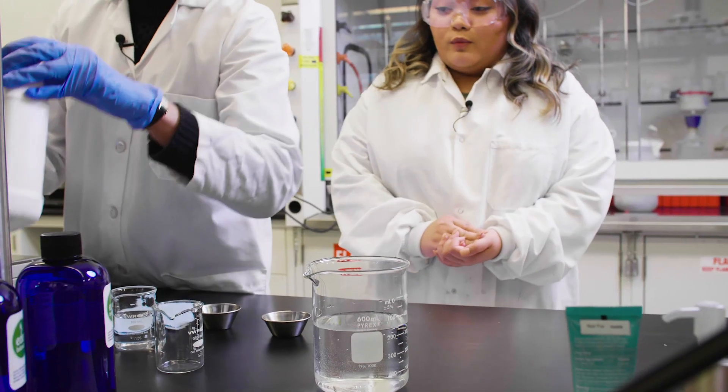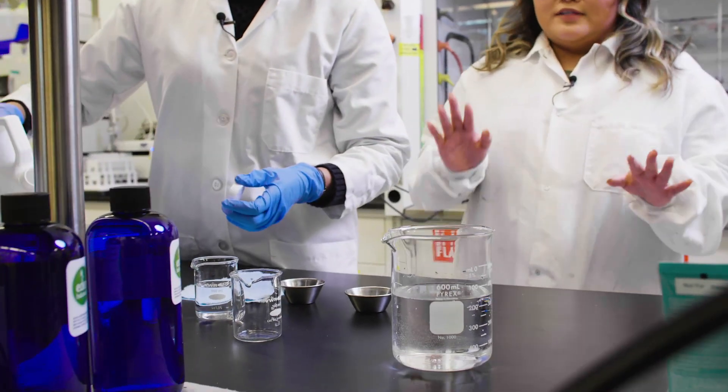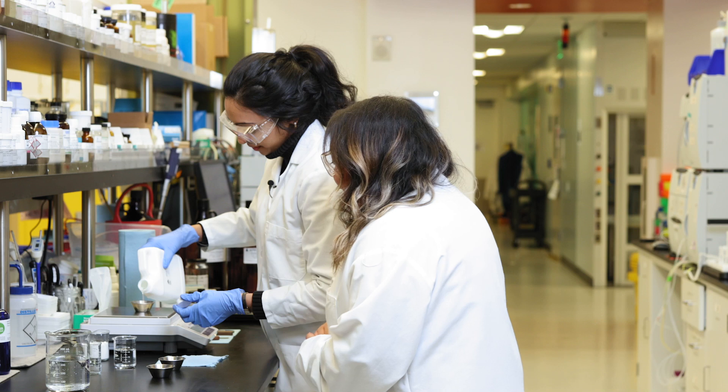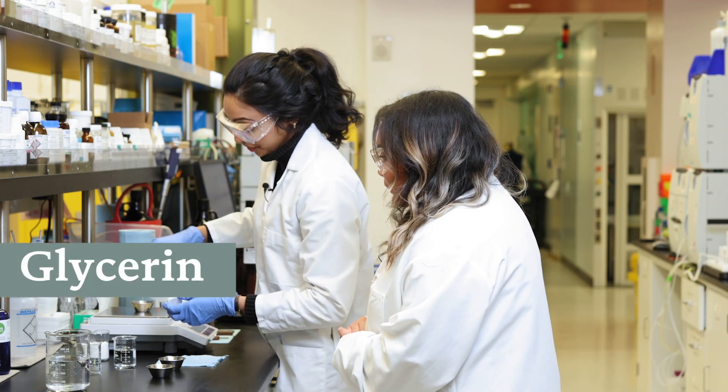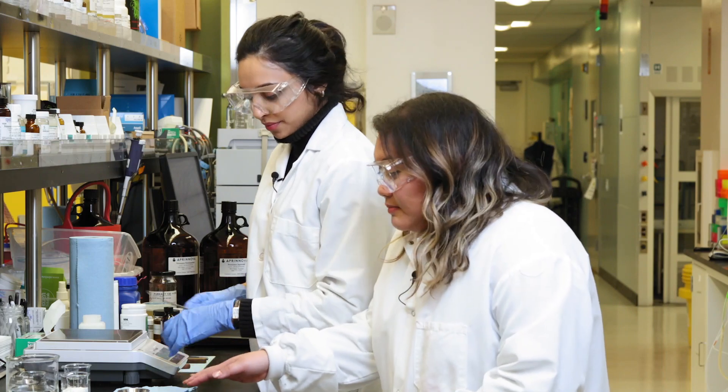Do you feel like when you're in the lab, you're kind of in the kitchen, like a chef, just creating stuff? Because this is kind of what I feel right now. Absolutely. What are you putting in right now? This is glycerin, so it helps with some of the moisturization.